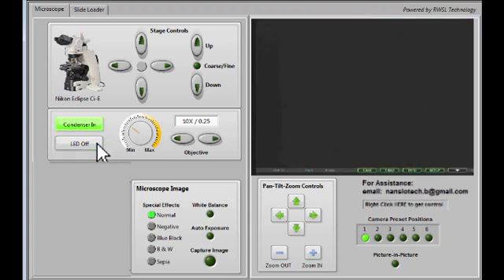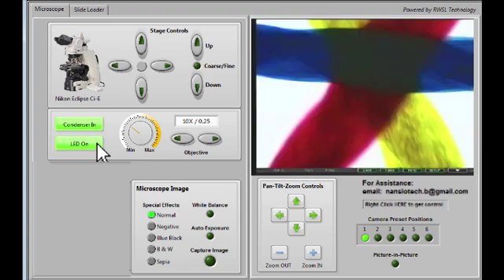Or turn it off entirely, although that's not very useful. Usually, it's best to leave auto exposure on.